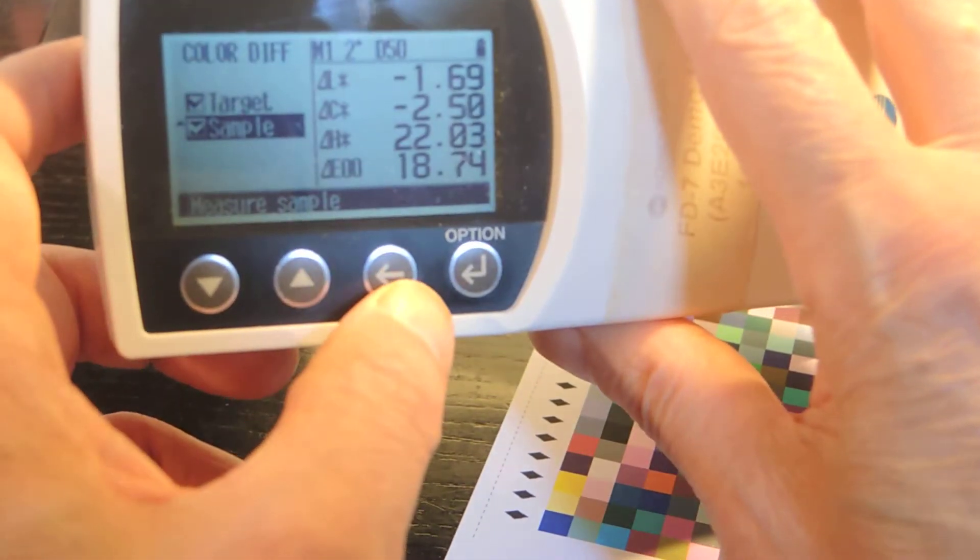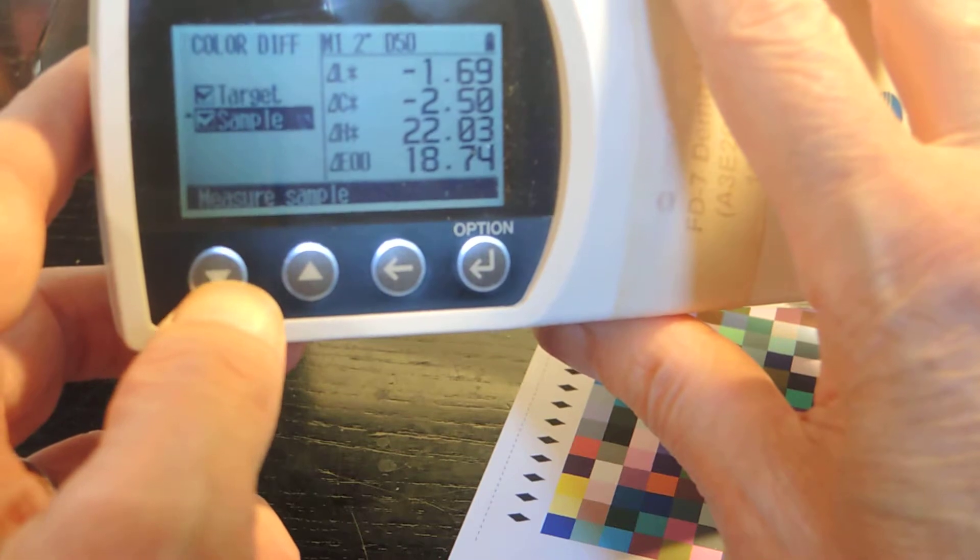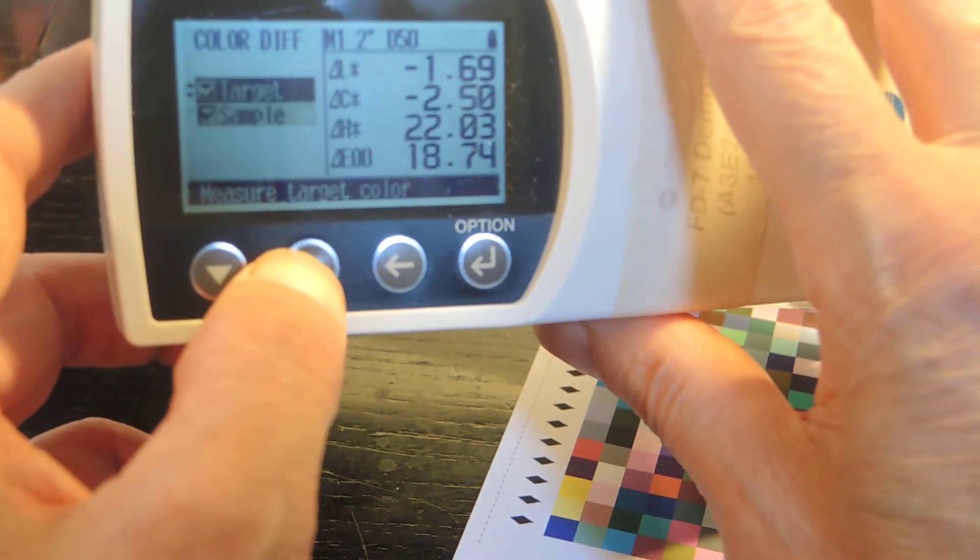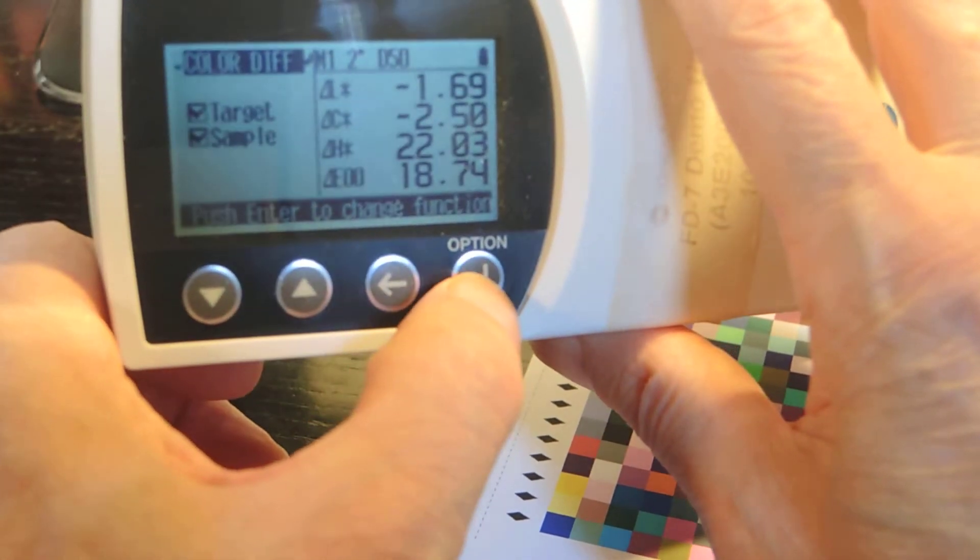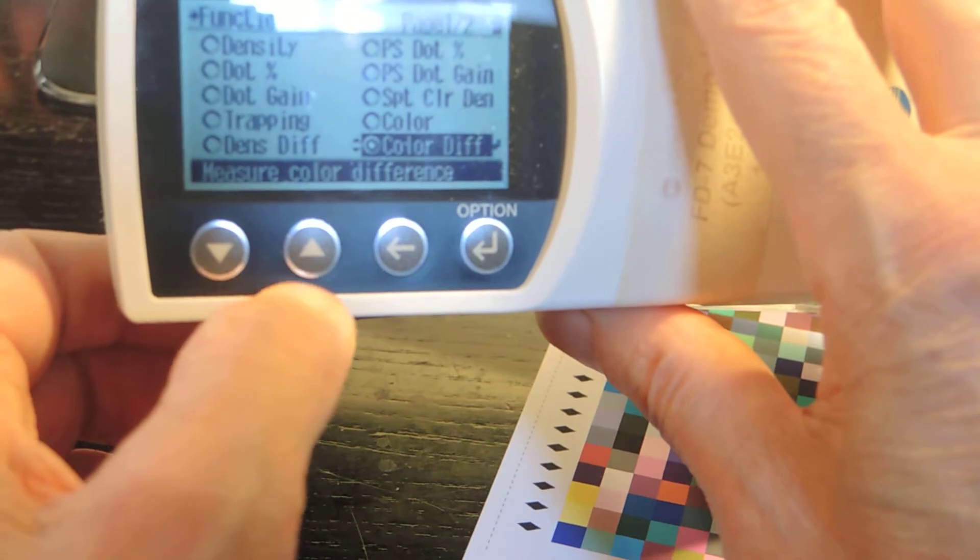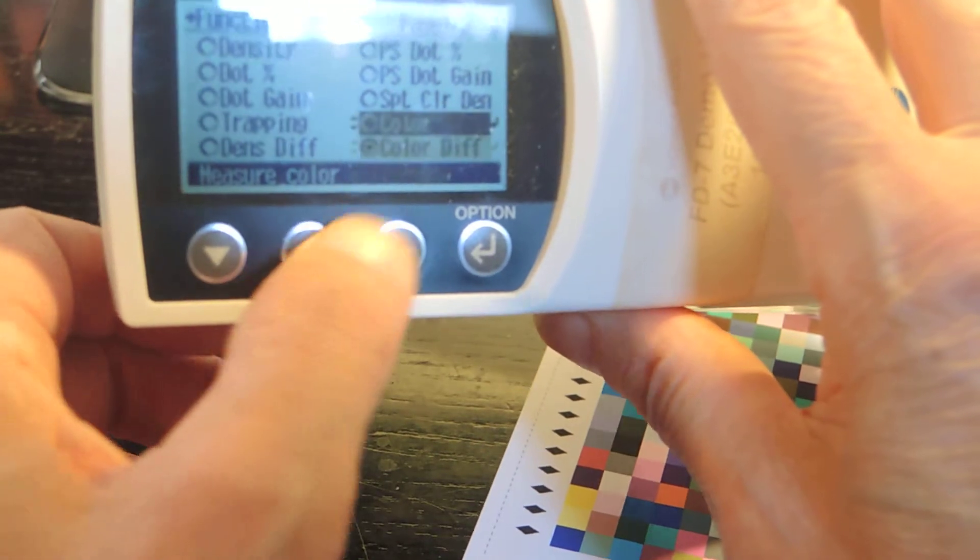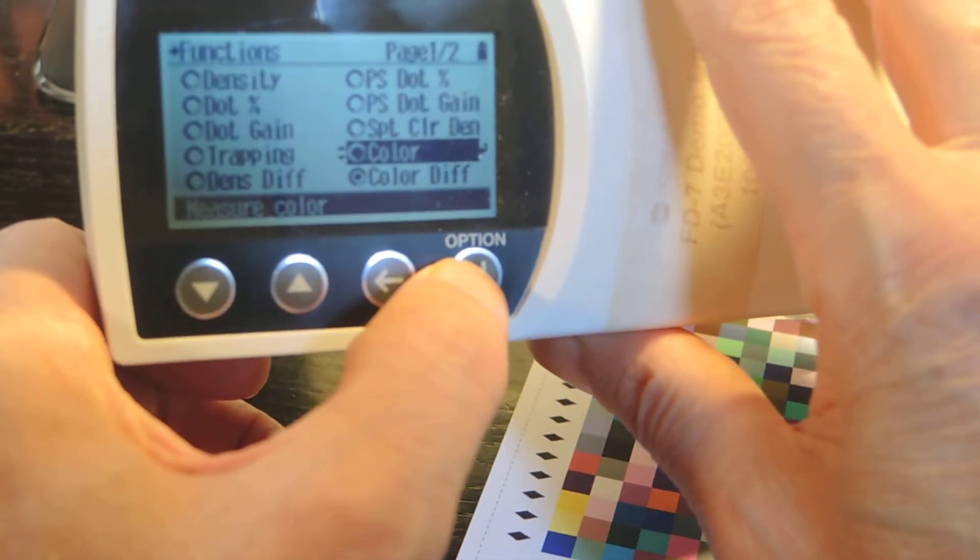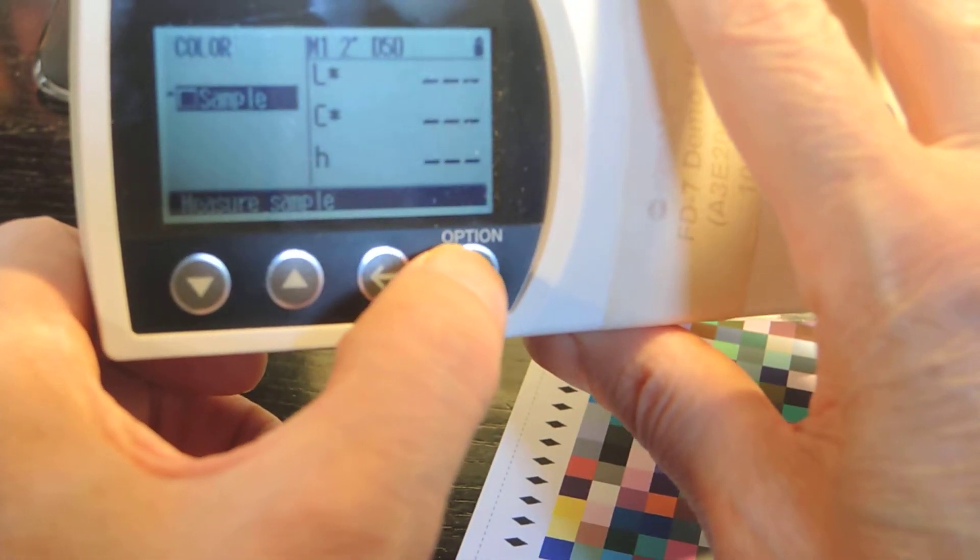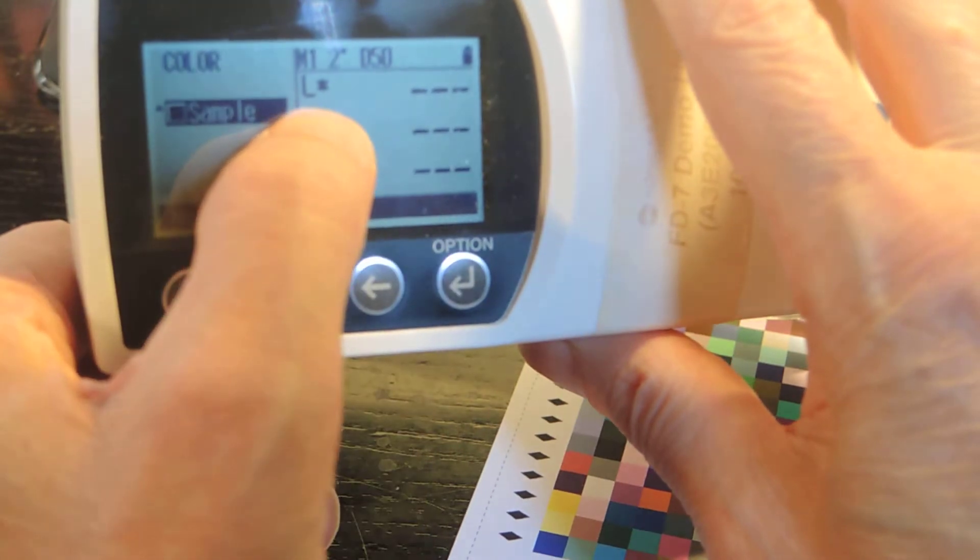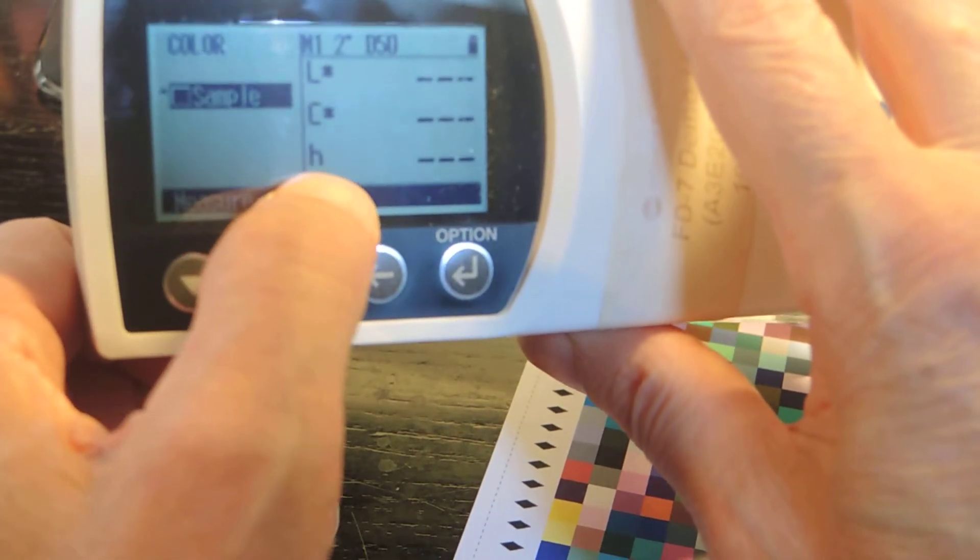So let's see if I can go back to just color. So option. And color is right above here. So I'm going to choose color. So now it is LCH.